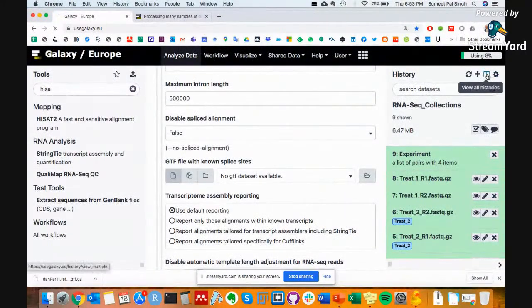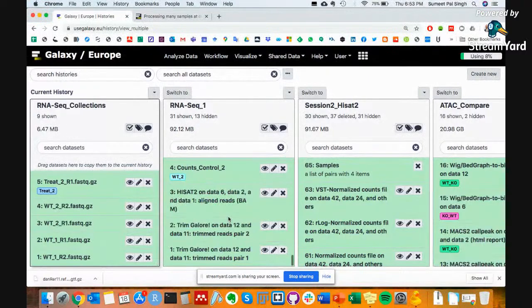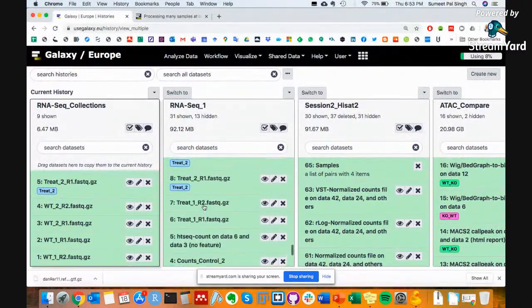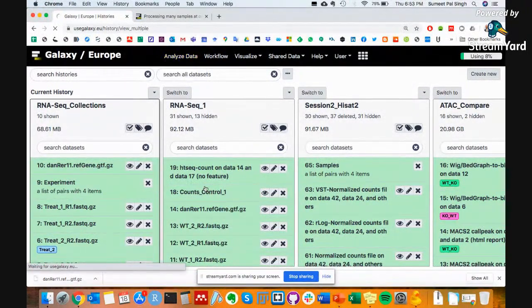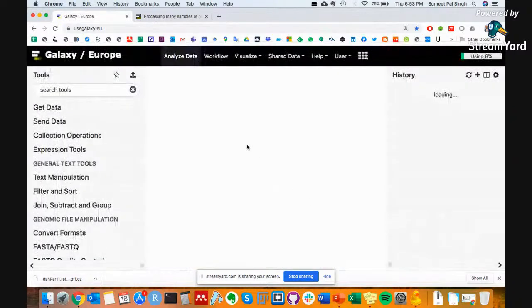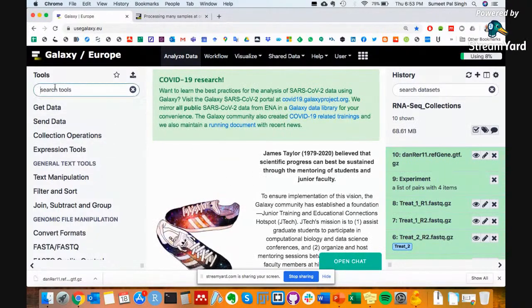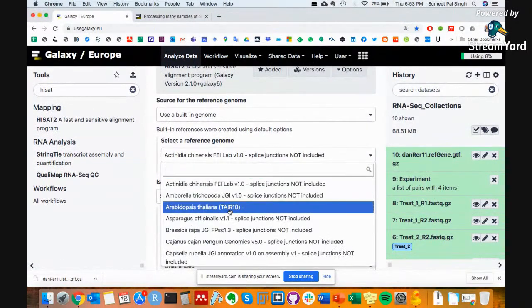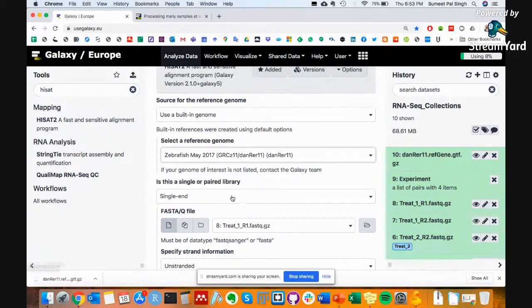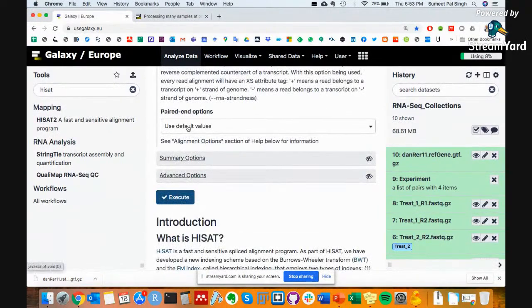Okay, we will put it from another history. This one, we move it here. Then we go to analyze. This is the only thing that we will just run. It's all for this session. As I said, we will not go into how to do GO analysis. I'll just put the links to some of the tools where it's possible to do it. But that's about it.